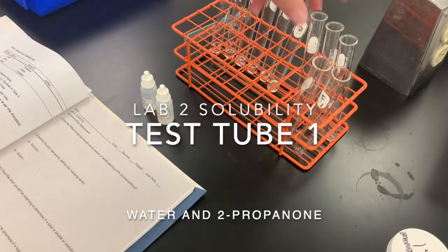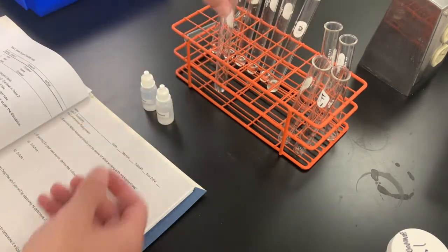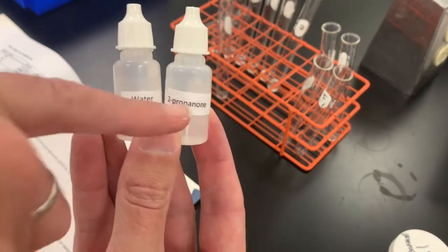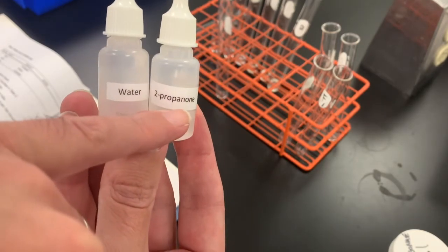In part two, test tube number one, we are going to be mixing water and 2-propanone. 2-propanone is otherwise known as acetone.